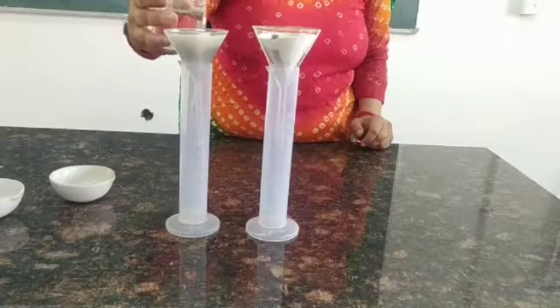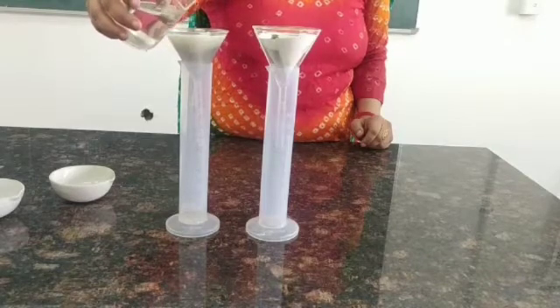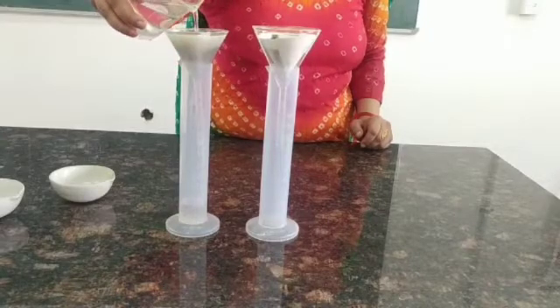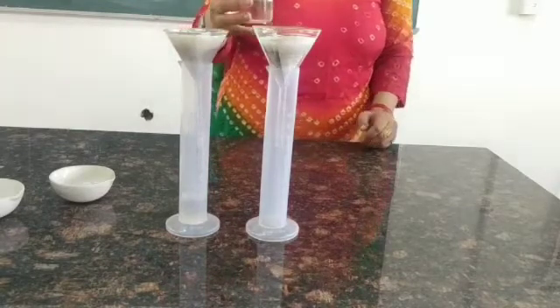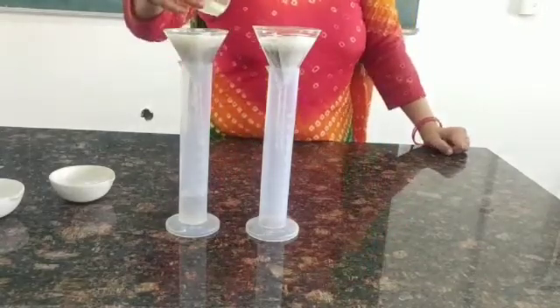We can see the water dripping down in the measuring cylinder. Slowly we are going to add water in the first funnel, and we are going to repeat the same thing with the second funnel — slowly putting the water in so that it is able to drip down.